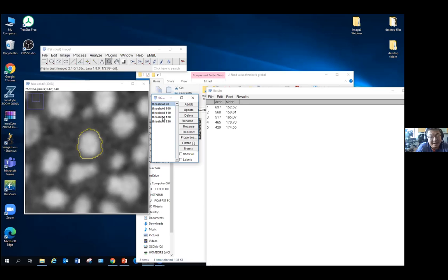The important thing is you have to use the same value on all the images. So always try to find a value which can work on the majority of your images and yields a reasonable result. That is where you should spend your time. I never suggest people spend much time playing on a single image to get what exactly the ideal result is. It's always about consistency, especially on fluorescence, the confocal images.